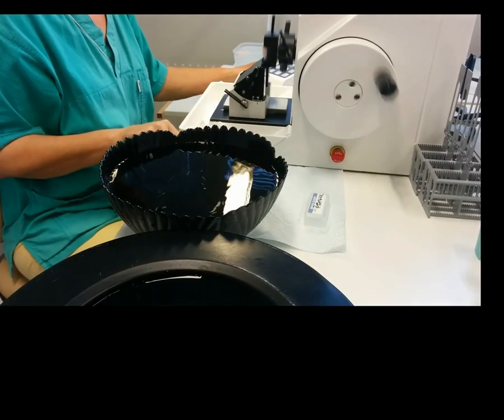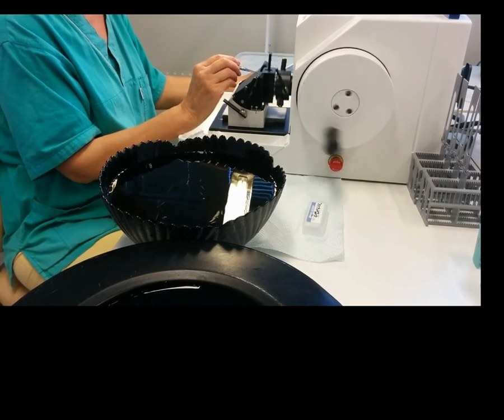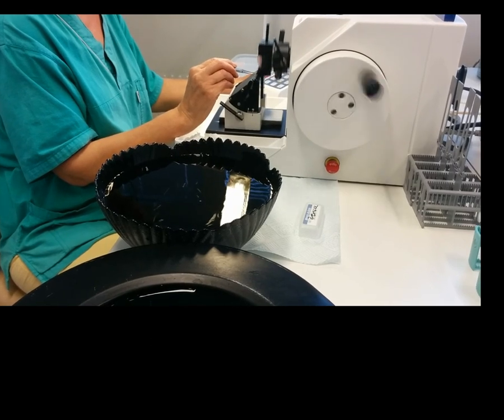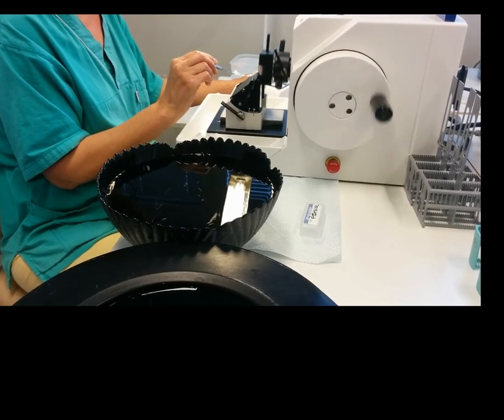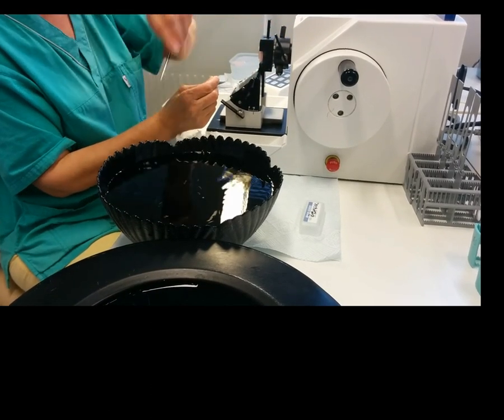It is easy to put sections on cover slips instead of slides. We will show you how to do that now. You should also watch the video about cleaning cover slips to increase the adherence of your sample. The procedure of applying your paraffin section on a cover slip follows the same steps as putting your section on the slide. As you can see, the paraffin block is sectioned and processed as usual.